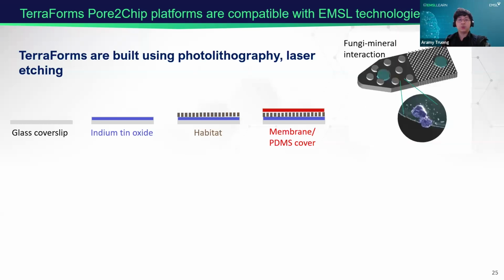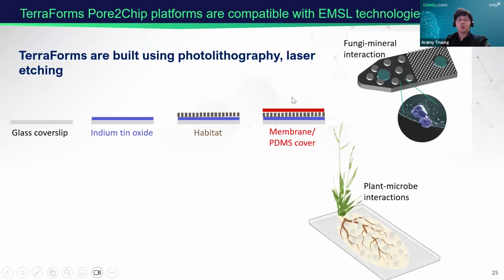And you can do things like grow fungi, grow microbes in it, or even if you scale it, like we talked about before, you can even grow plants and plant roots.